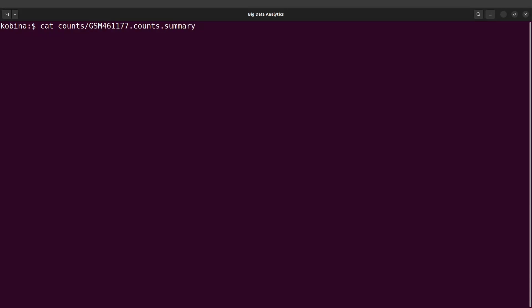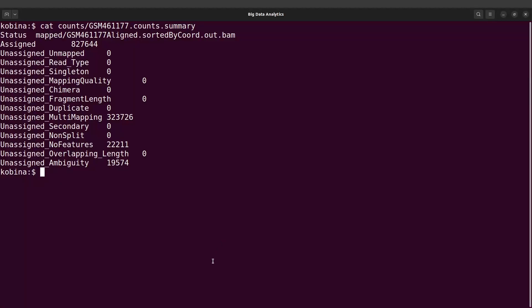We have the counts.summary file. This will display the count summary file. It shows assigned reads with a number, unassigned unmapped, unassigned with ambiguity, unassigned multi-mapping, etc. This gives you the various counts for assigned features — the features that featureCounts identified and the read counts assigned to them.